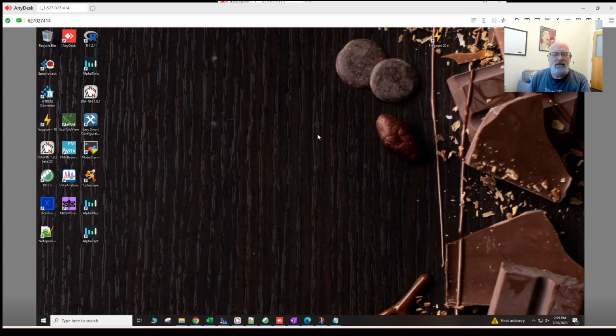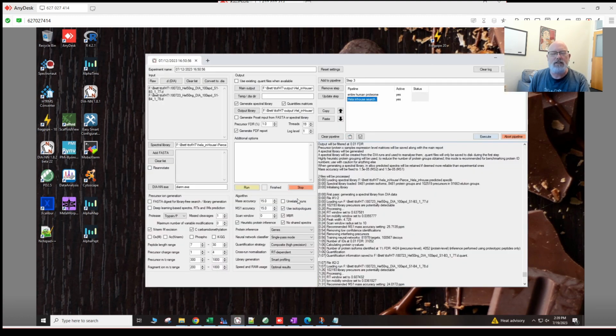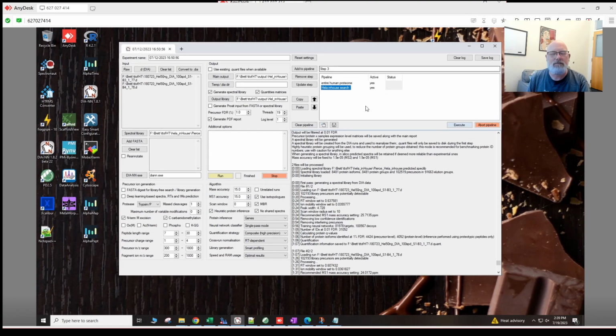Okay, so what you want to do is make your DIANN search. What we're searching now are two 50 nanogram HeLa samples I just did as a QC for my new Bruker timsTOF HT. I searched them with two different libraries.